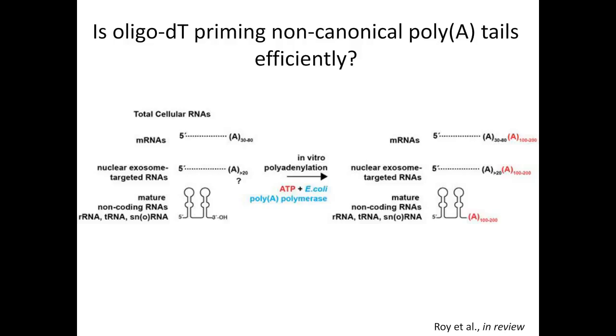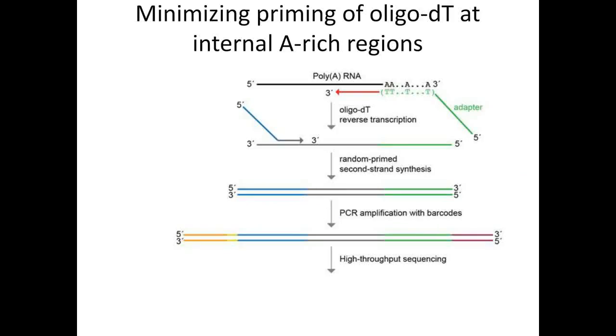oligo-dT was somehow internally priming within the poly-A tail, and that would lead to a substantial amount of poly-T, actually, because it's reading the poly-A tail during the sequencing reaction. It will read a stretch of T's. We didn't see any increased prevalence of that with in vitro polyadenylation versus non-in vitro polyadenylation. That is mitigated by the fact that the oligo-dT primer, which I didn't indicate in the slide, has a V at the end, meaning anything but T is at the very 3' nucleotide, and that substantially prevents internal priming of the poly-A tail. So we think that's an effective way to reduce the poly-T reads that are occurring.